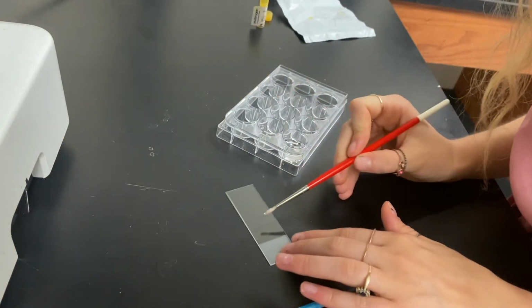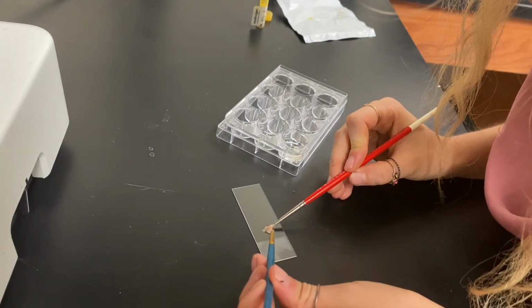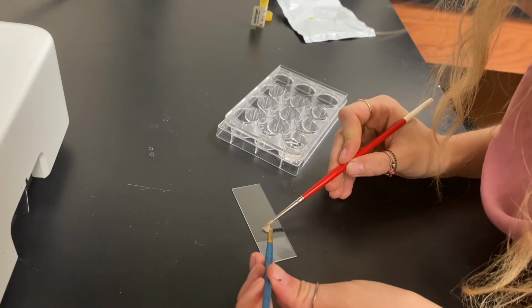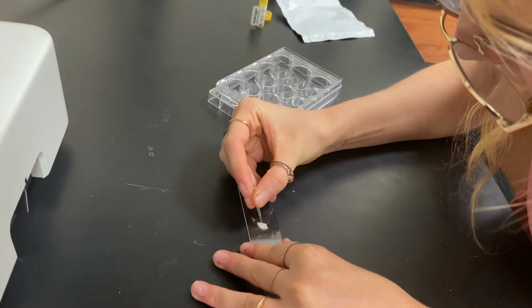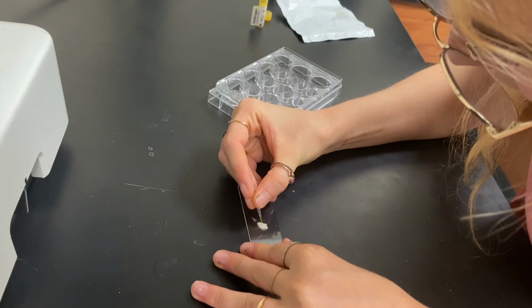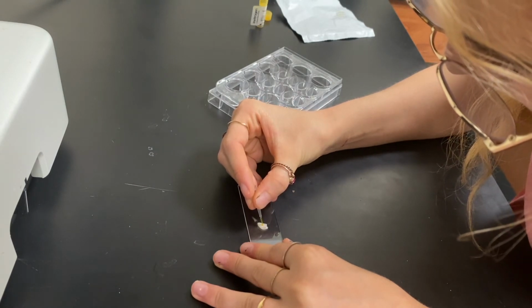I want to note that this process of staining live cells doesn't start with a fresh brain slice like I show. It starts with a live mouse. Now, I won't show the decapitation or any gory stuff, but in a future video, I'm planning on showing the behind-the-scenes process of how I take the brain from its body and into these incredibly small slices.